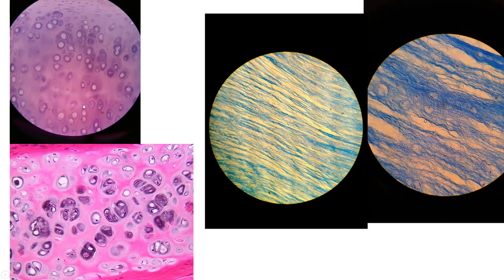This is hyaline cartilage, the most common type of cartilage, also the weakest. So it should have a glassy type appearance. You are seeing the smoothness of it. You shouldn't see any fibers. And these are chondrocytes lying in spaces called lacunae.